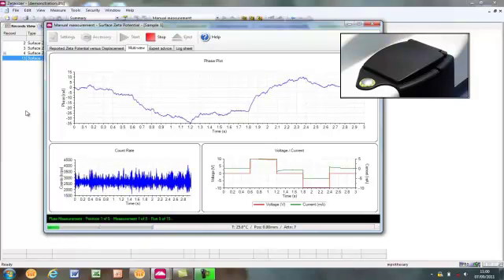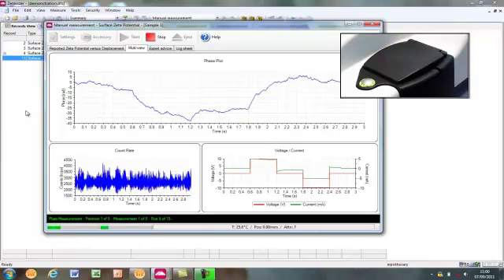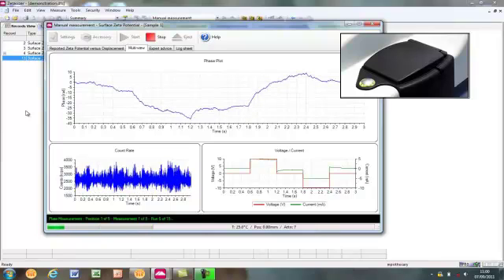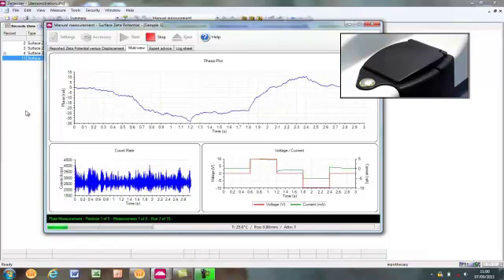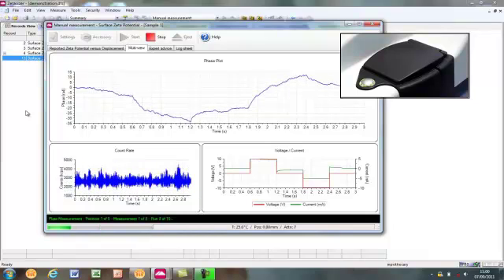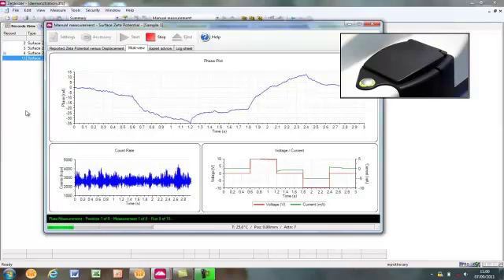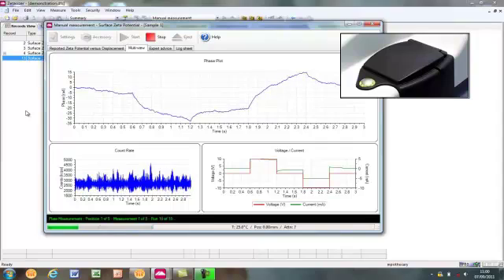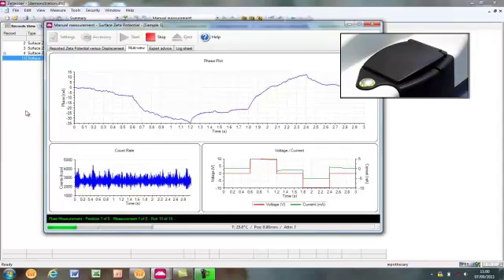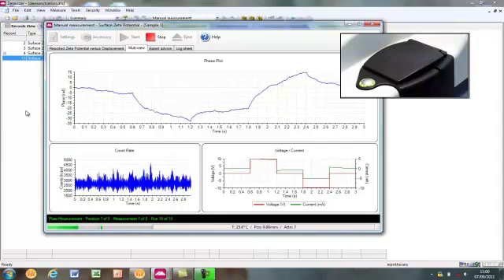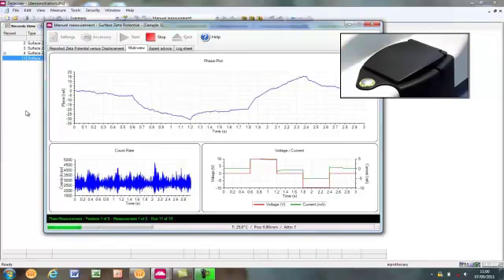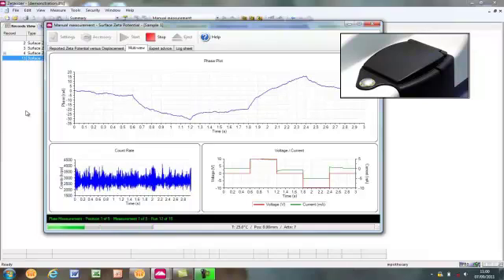The voltage and current plot, in the bottom right, shows the applied voltage and the measured current. In the bottom left-hand corner of the live measurement window, the progress bars and text denote the current stage of the measurement. We are currently measuring at the first measurement position closest to the sample surface, and the software is performing measurement number 1 of 5. The phase plot, while noisy at first, should improve as the measurement progresses. The measurement will proceed until all of the measurements at that position have been made.